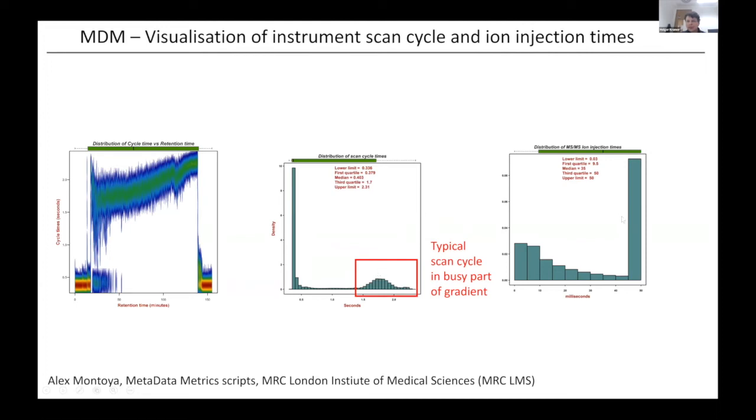And then in total, you can also summarize all of the MS2 accumulation times. So essentially we ask the question, how long did it take for all of the MSMS spectra to be generated? There are some, from presumably quite intense precursor ions, where this was a very quick process and took 10 milliseconds or less. But then we have a whole bunch of spectra that successively take longer.